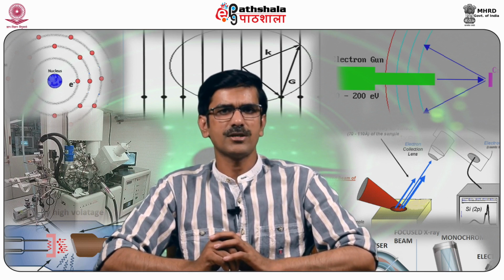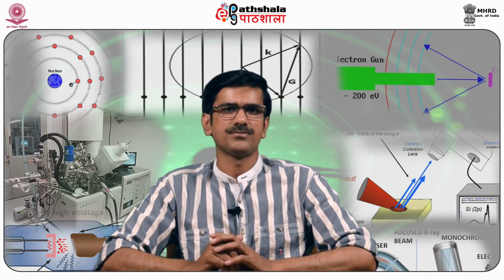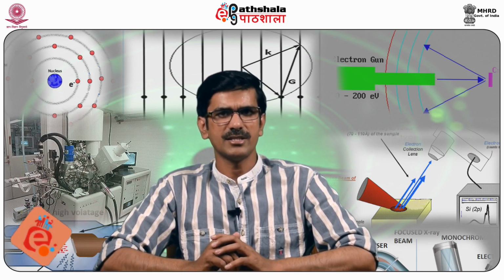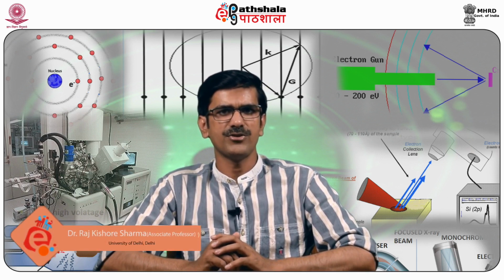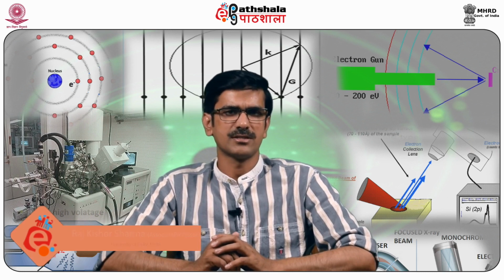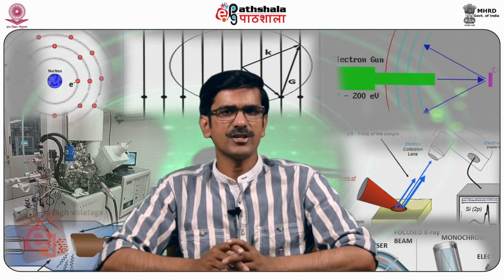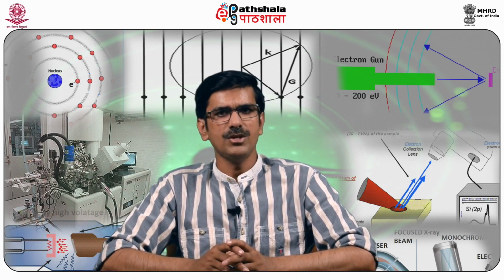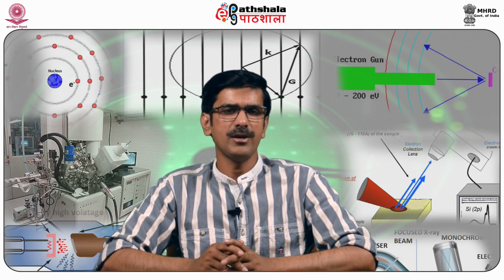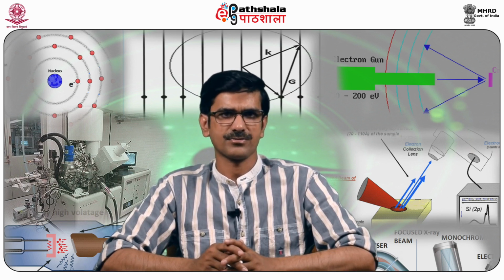The intensity of the spectra produced is also dependent on the kinetic energy. Within the broad picture of the two main analyzer classes, there are a variety of specific analyzers in existence that are used in PES, that is, the cylindrical deflection analyzer, the spherical deflection analyzer, the plane mirror analyzer, and the cylindrical mirror analyzer. Thank you.